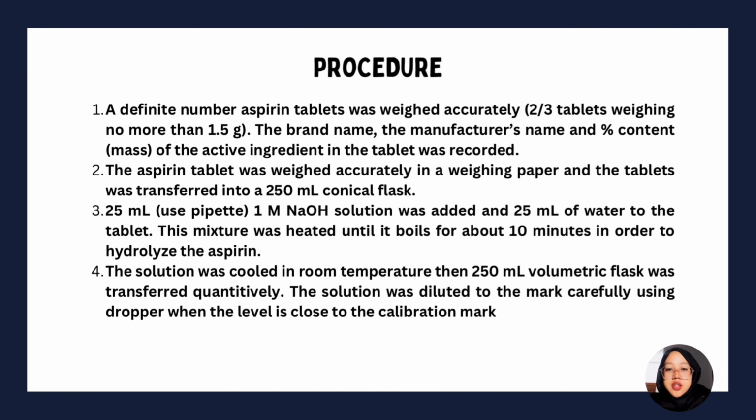Firstly, a definite number of aspirin tablets was weighed accurately. 2 or 3 tablets weighing no more than 1.5 gram. The brand name, the manufacturer's name, and the percent mass content of the active ingredient in the tablet was recorded.